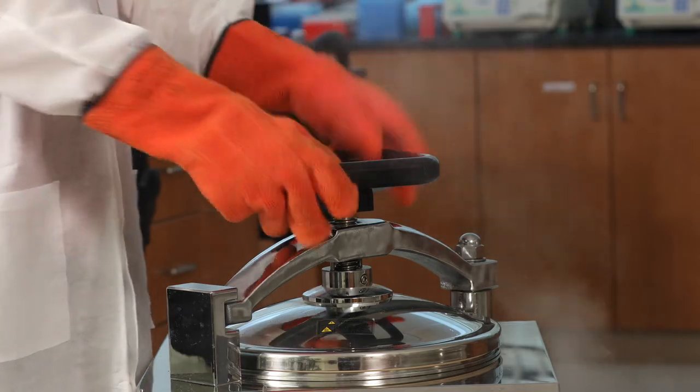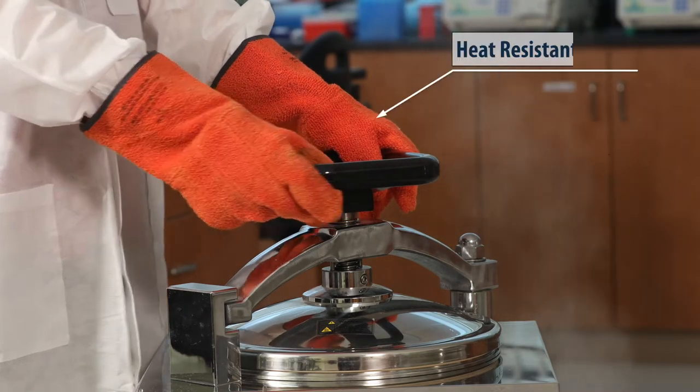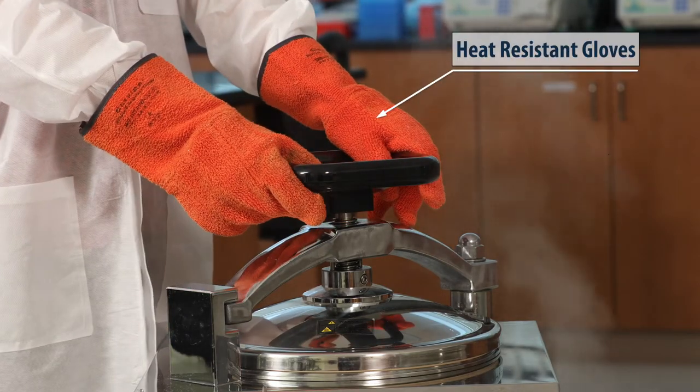You may need special PPE depending on the work you're doing, like these heat resistant gloves for opening the autoclave. That's PPE.